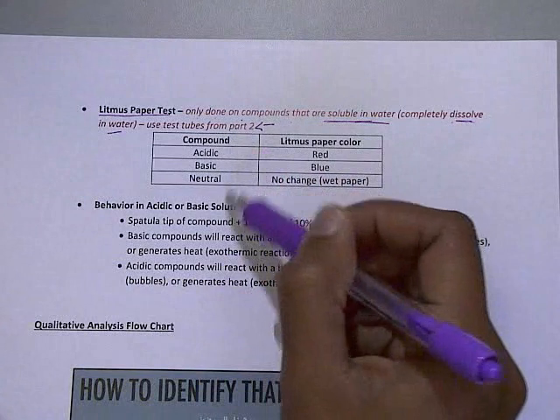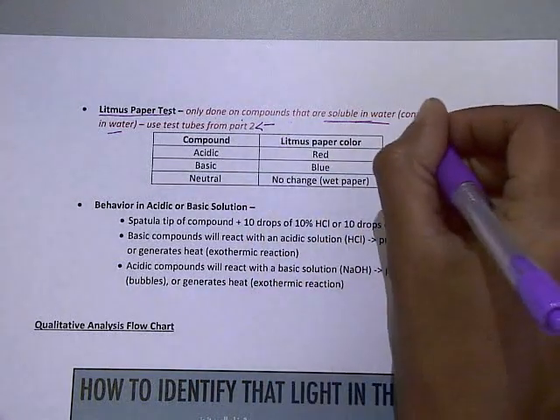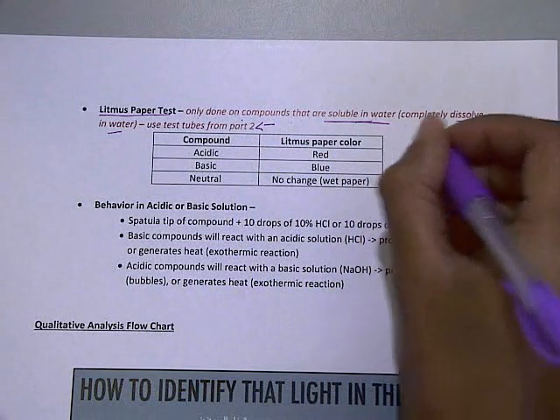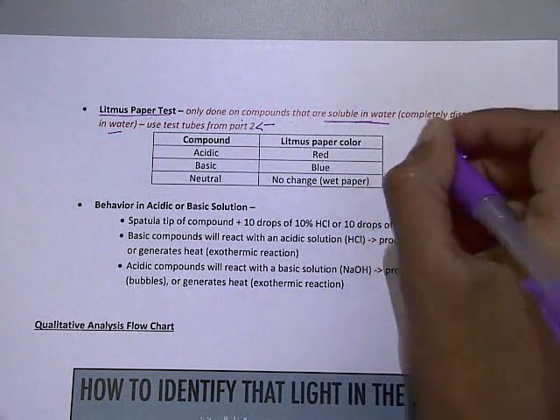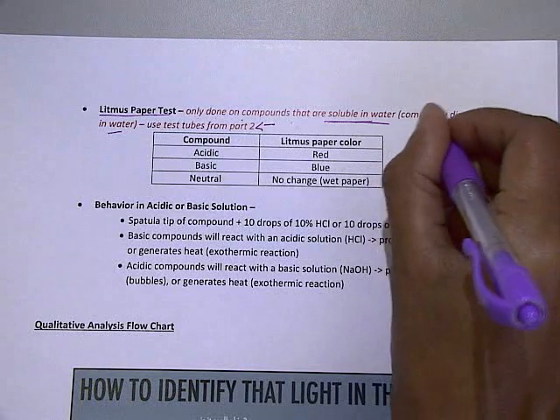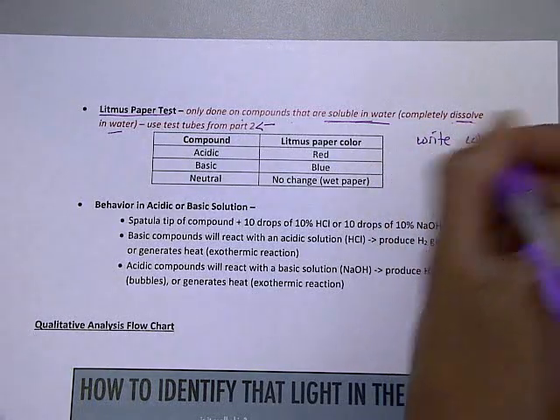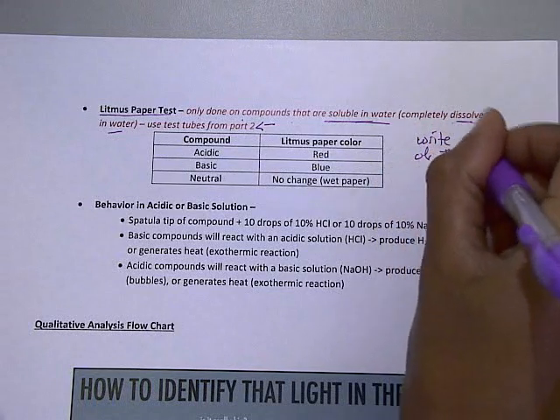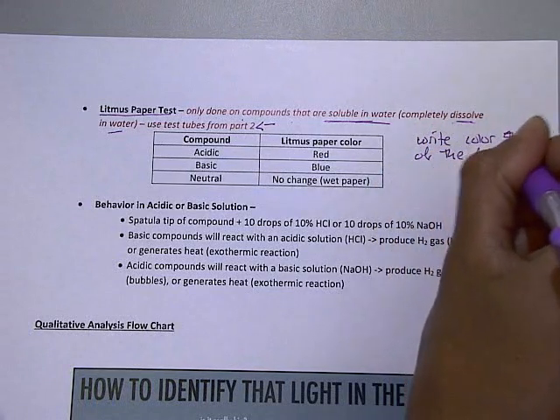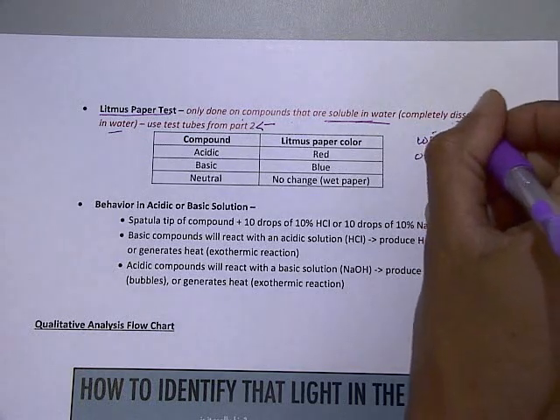So, an example of a setup. First of all, I want you in your lab notebook to make observations of the litmus paper. So for example, the litmus paper initial observations, I want you to write the color of the litmus paper, the initial color.